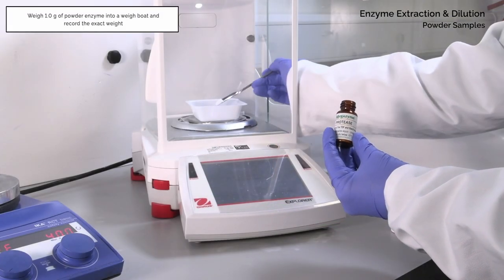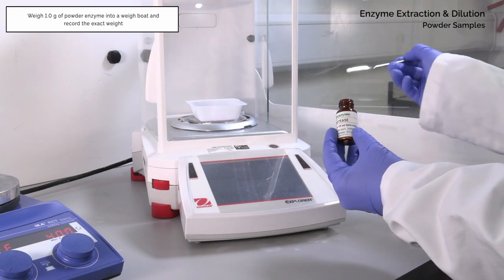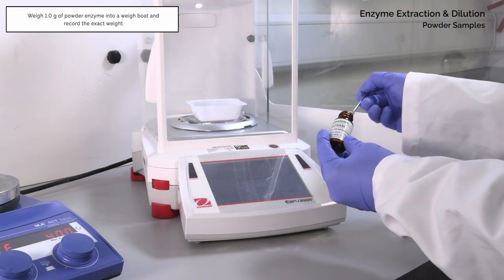For powdered samples, weigh 1 gram of powder enzyme into a weigh boat and record the exact weight.